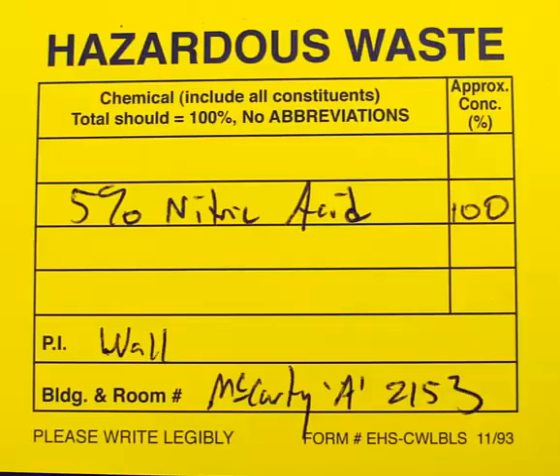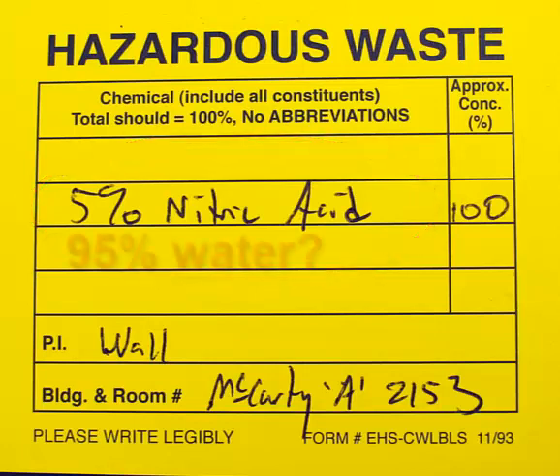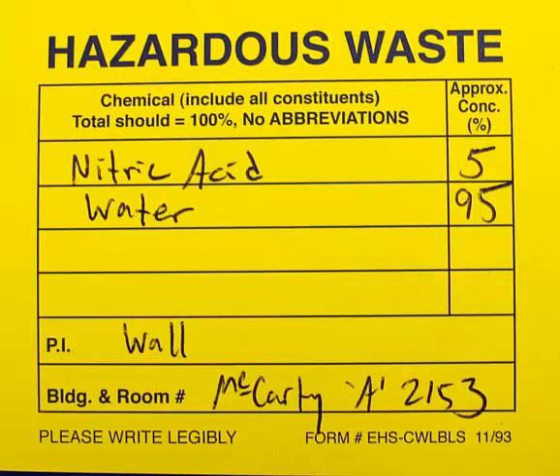Please ensure that you tell us everything that is in the bottle, including an approximate percentage of water, if any is present. For example, it is not enough to simply tell us 5% nitric acid and then hope that we correctly assume that the other 95% is simply water. If it is simply water, please make sure to label it that way, which will avoid any confusion.